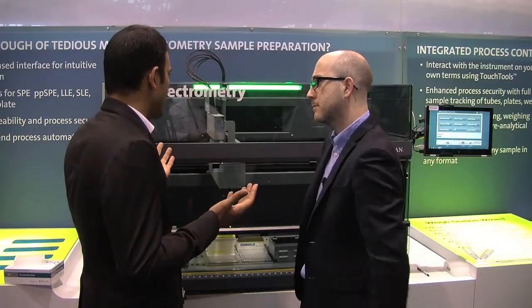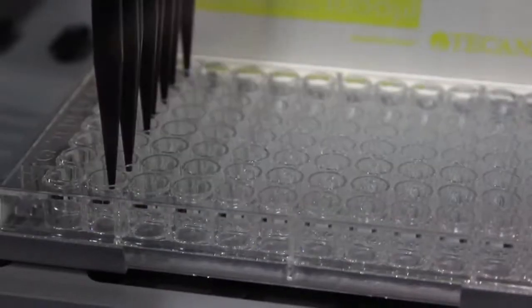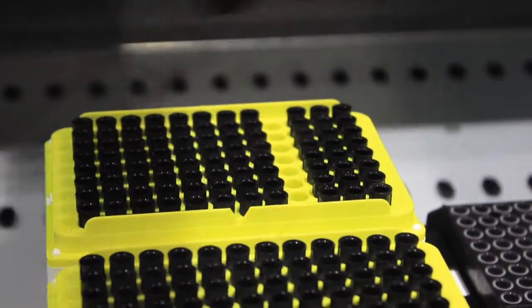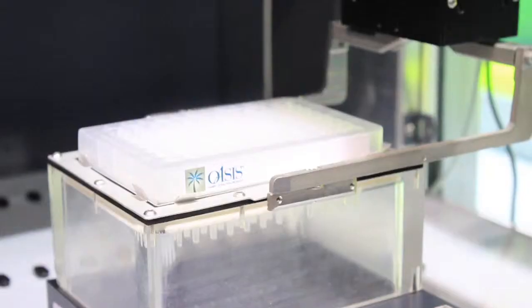As well as the plate, are you highlighting anything else here at the show? Sure. What we are highlighting here is a single workstation, what we call the mass spectrometry sample preparation workstation from TECAN. It's a single workstation that can accommodate a variety of protocols such as dilute and shoot experiments, solid phase extraction experiments, liquid-liquid extraction experiments, protein precipitation. One unit to take care of all your sample preparation needs.